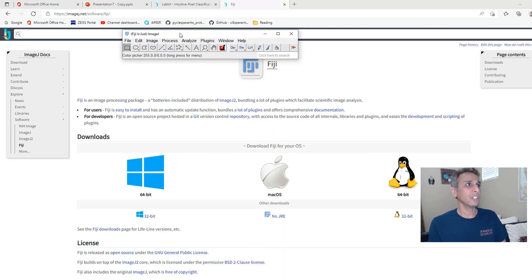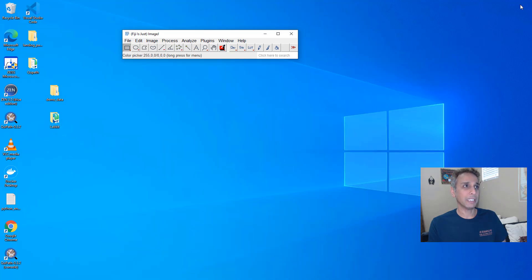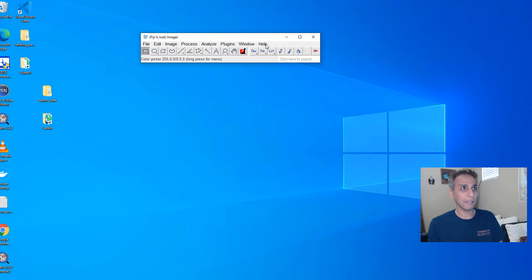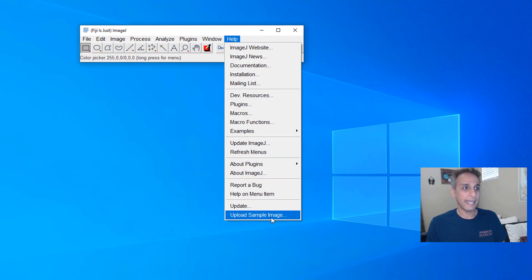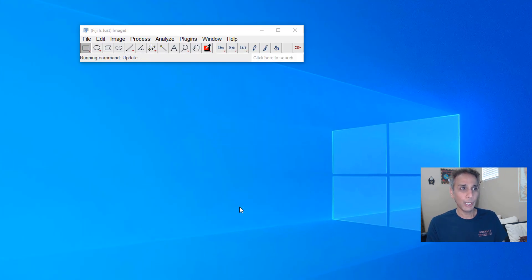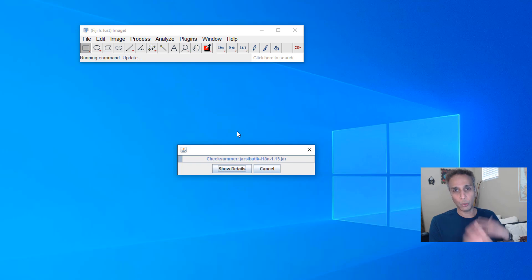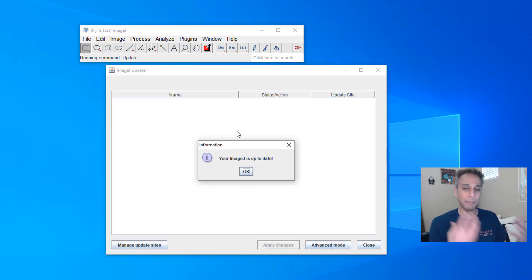So how do you do that? First thing first, let me remove the background here so it makes it easy for you to focus. So let's go to Help and Update and if this is the first time you're updating it may actually update a whole bunch of stuff.